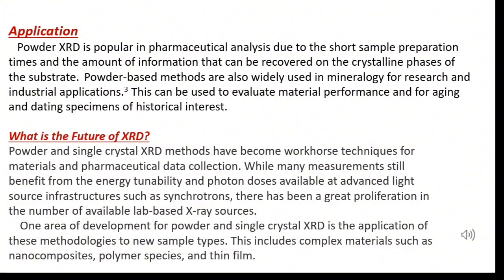Finally, we talk about the application of X-ray diffraction and the future of X-ray diffraction.